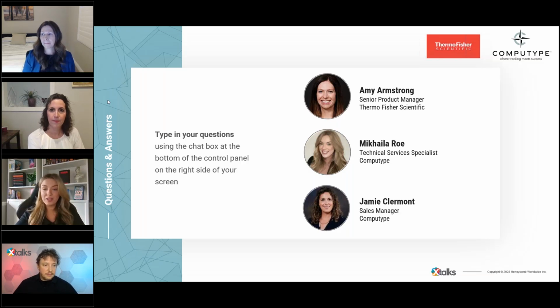So I think the best way to start with implementing custom solutions is don't do it by yourself. Reach out to a vendor or a partner like Thermo Fisher or Computype, someone that can help guide you through the process. It's unnecessary to try to become an expert in all things identification, and there are resources out there that can help you find the best way that will still accommodate your current infrastructure, what you have in terms of equipment, and they can guide you to certain solutions based on your budget or any other concerns that you might have.